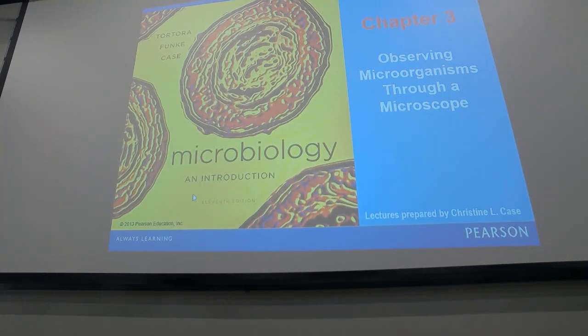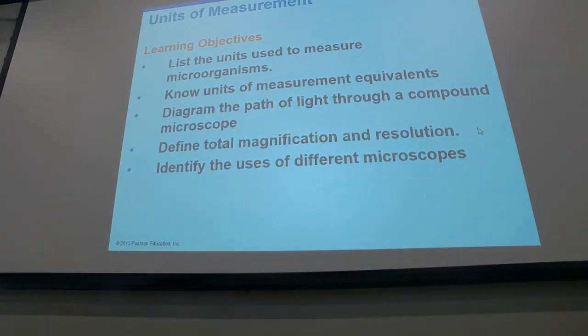Okay, so chapter 3 is about microscopy. In this chapter, we're going to learn what the units of measurement are for measuring microorganisms.